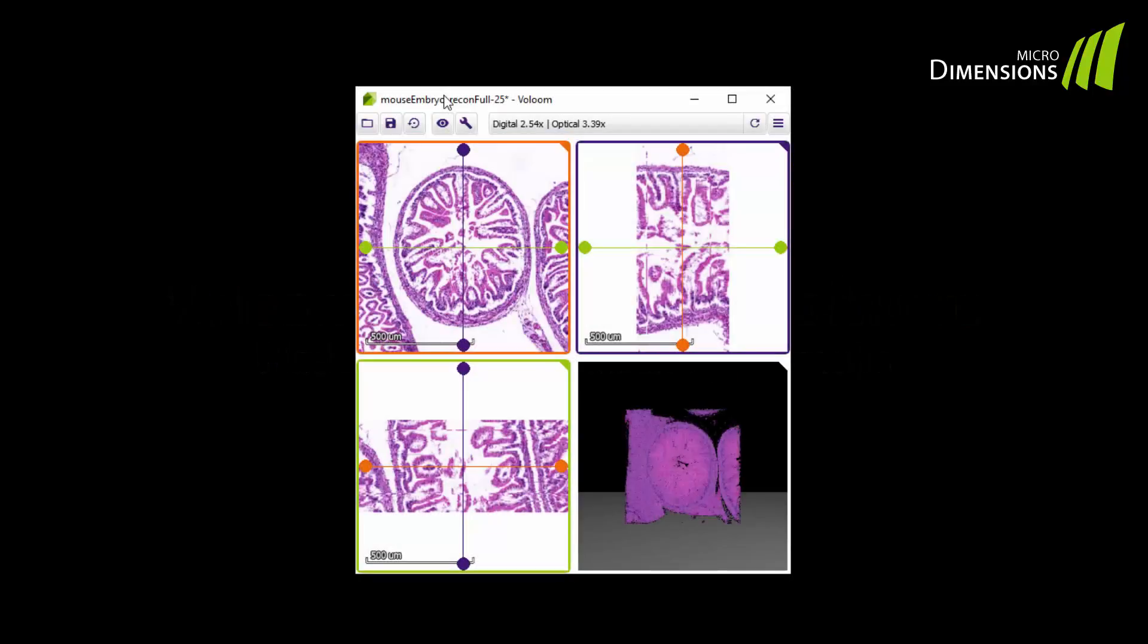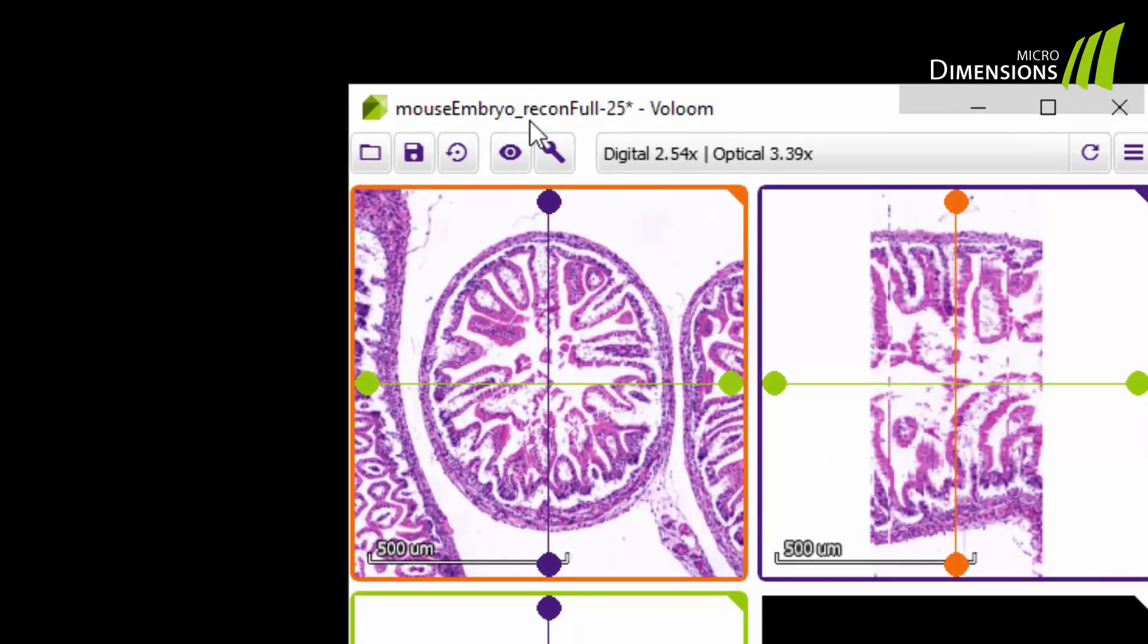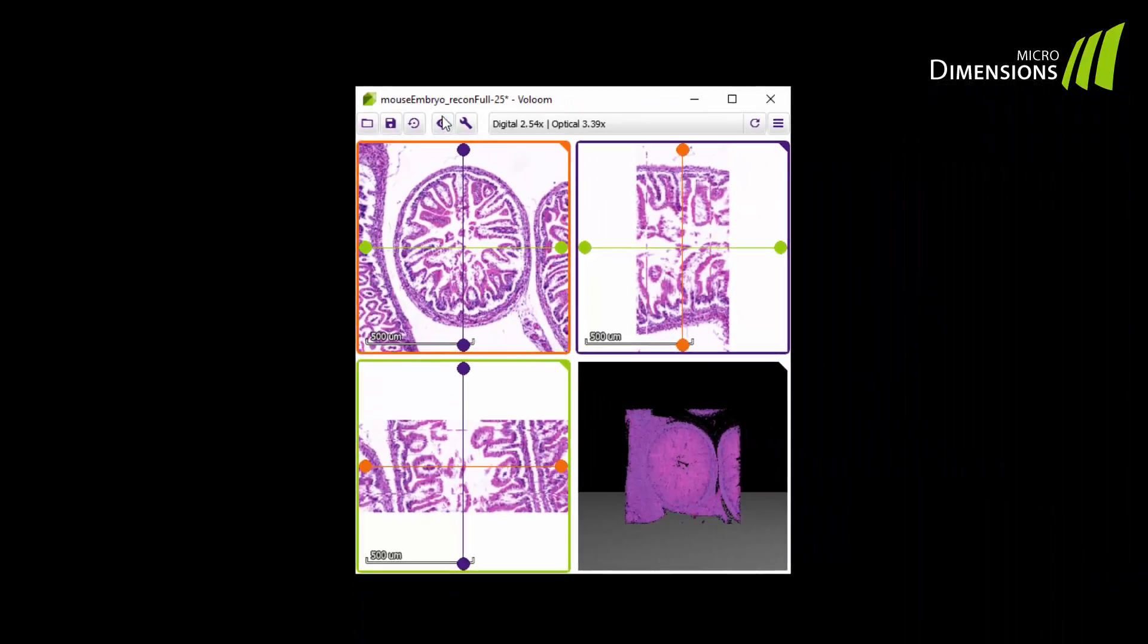What you see here is the four-view interface of Voloom. In the upper left corner, you find the serial sections you have reconstructed before, shown as a stack of images.